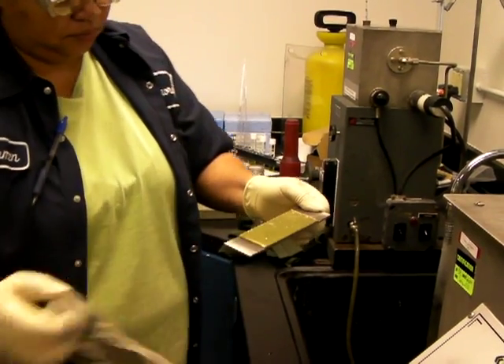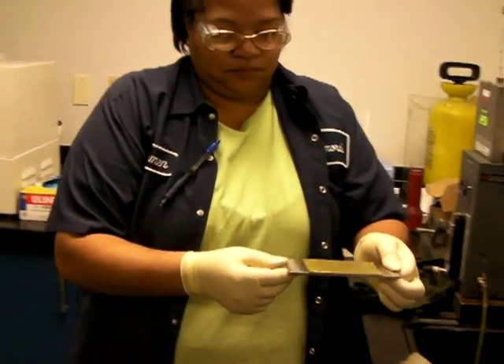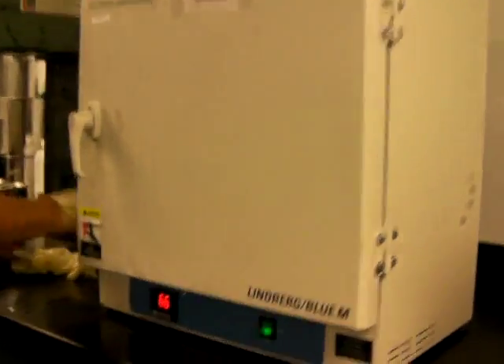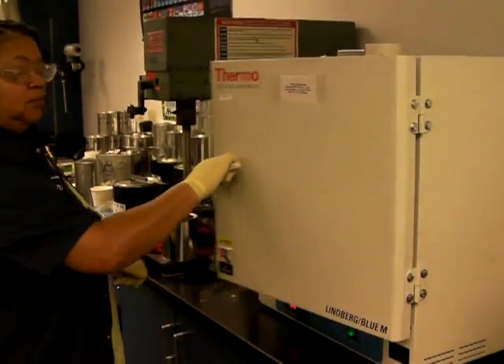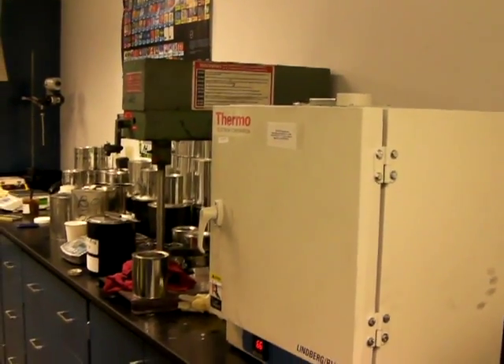You can just see by looking that not much of that Vortex has come off. And then it goes into an oven set at 66 Celsius. It'll spend one hour in there drying. So we'll just shut off now and come back in an hour.